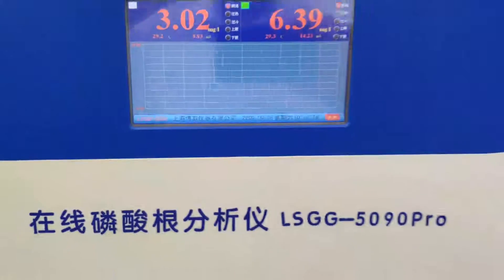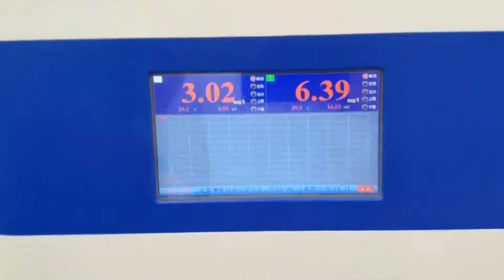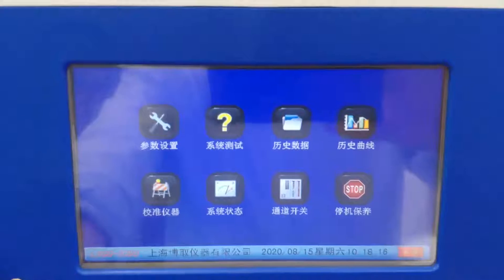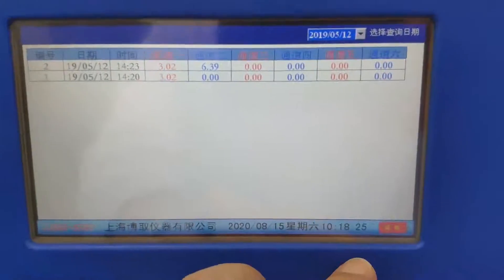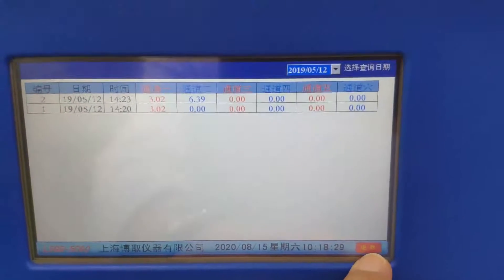It features a touch screen. For foreign countries, we use an English menu.